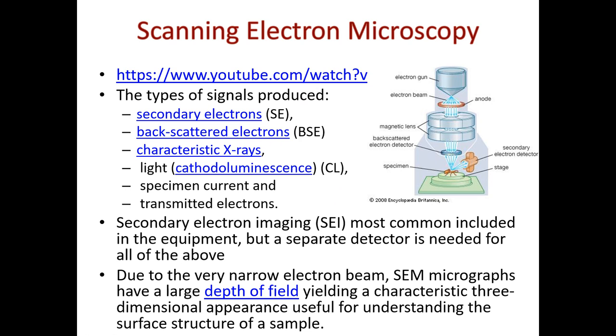During the interaction, there might be some electrons or some other type of particles produced, depending on the energy. You could also have some X-rays emitted, for instance, while during the interaction the electrons in the material will change possibly position in the atom, and that change will result in emission of some of the X-rays. So during that interaction, you can record back how this material responds, and you can also try to record some transmitted electrons if your sample is thin enough. If it's thin, some of it will go through, but if it's not thin, it will scatter back for the most part. So there has to be some sort of detector of electrons that's coming back that is associated with this machine. Okay?